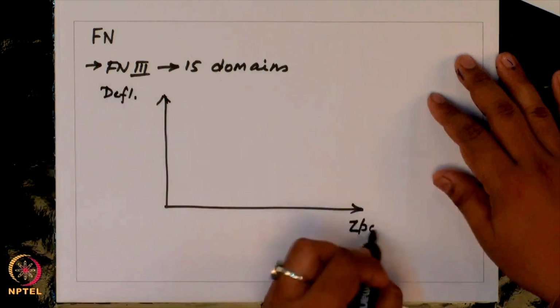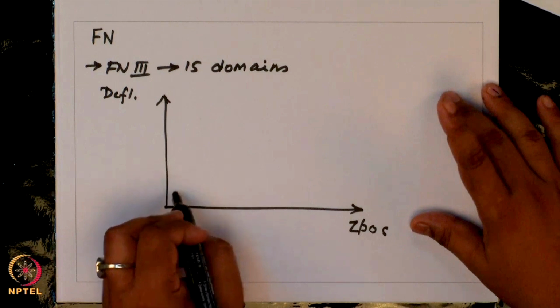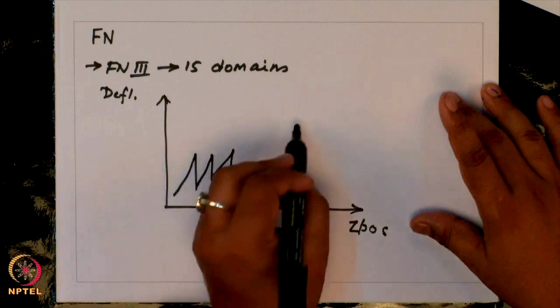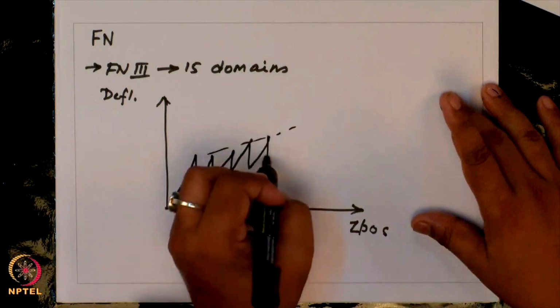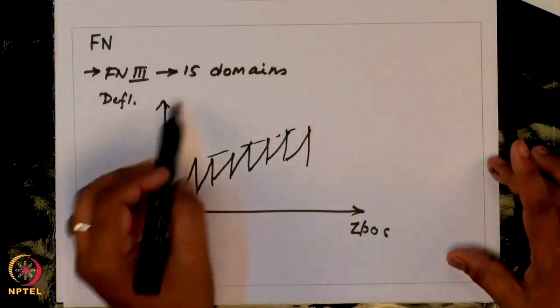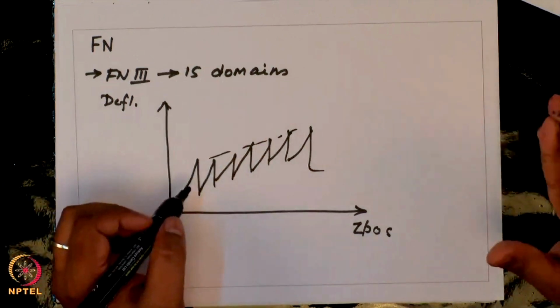one thing that you observe is you will get these multiple peaks, and so on and so forth. I am not drawing all 15 domains, but you will have these multiple peaks which might have comparable lengths, comparable forces, so on and so forth. So it is near impossible to assign the peaks.